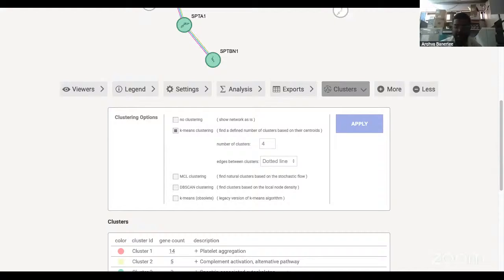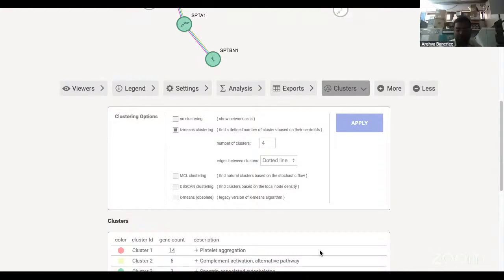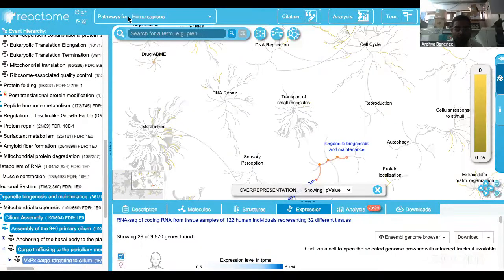Once this is done, I am going to show you one more software which is called Reactome. I can select my protein list which is present. I can come to the Reactome. So this is how Reactome looks like. I can click on the search site. Just I will go through the start.